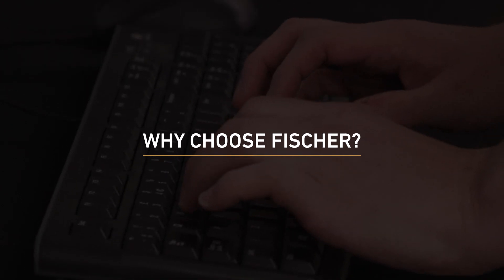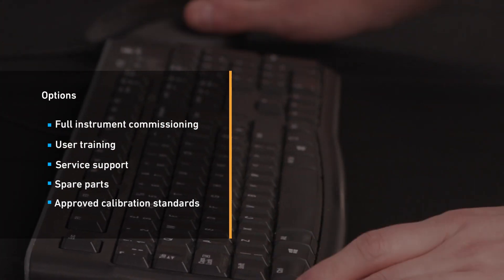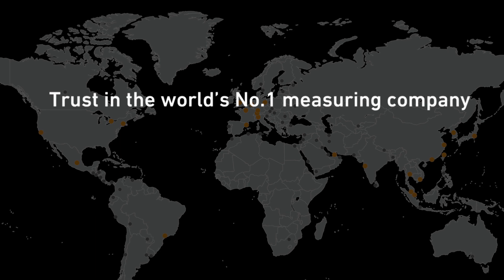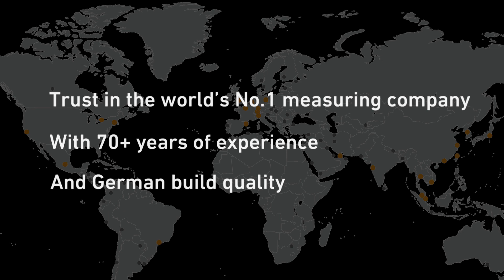Why choose Fischer? Fischer customers benefit from full instrument commissioning, user training, service support, spare parts, and approved calibration standards. Trust in the world's number one measuring company with 70 plus years of experience and German build quality.